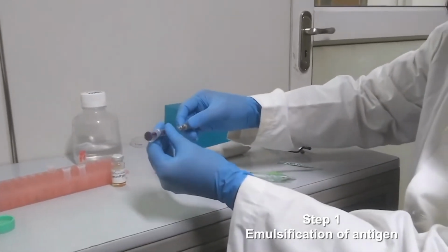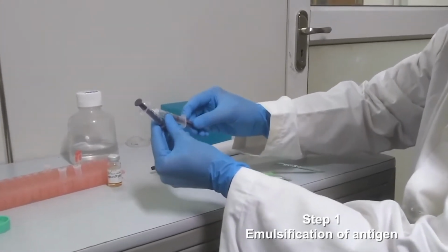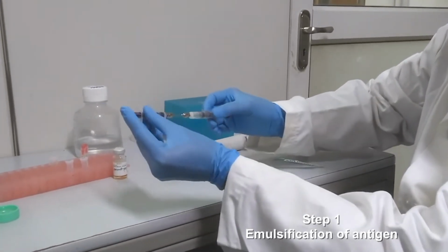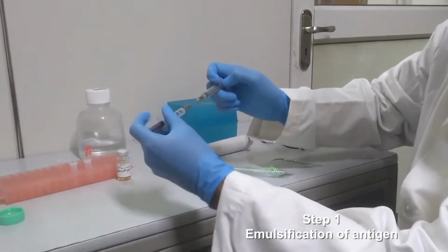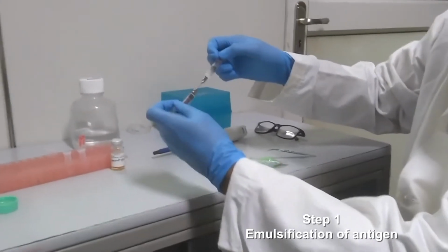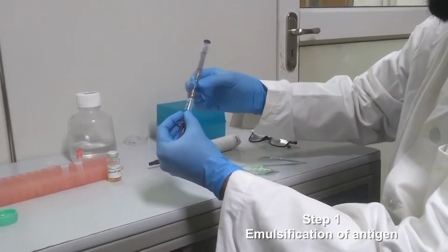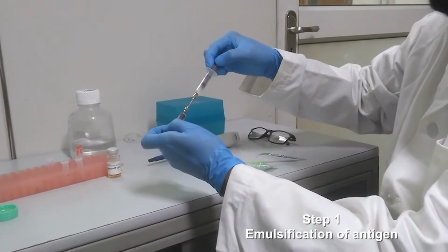Like this. So once you have filled your antigen and the adjuvant in this needle, you push it here, and then you keep pushing from one side, keep pulling from another side, keep pushing from one side and keep pulling from another side. So this process forcefully pushes your material, I mean the oil and the antigen, through this fine needle, and in that process, the emulsion is formed.